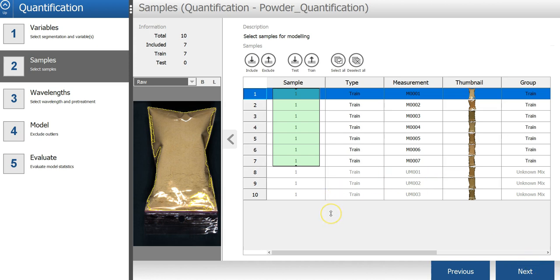In the second step of the wizard, I can select the samples that I want to include in the model. By default, it has included all the training samples, which is okay.